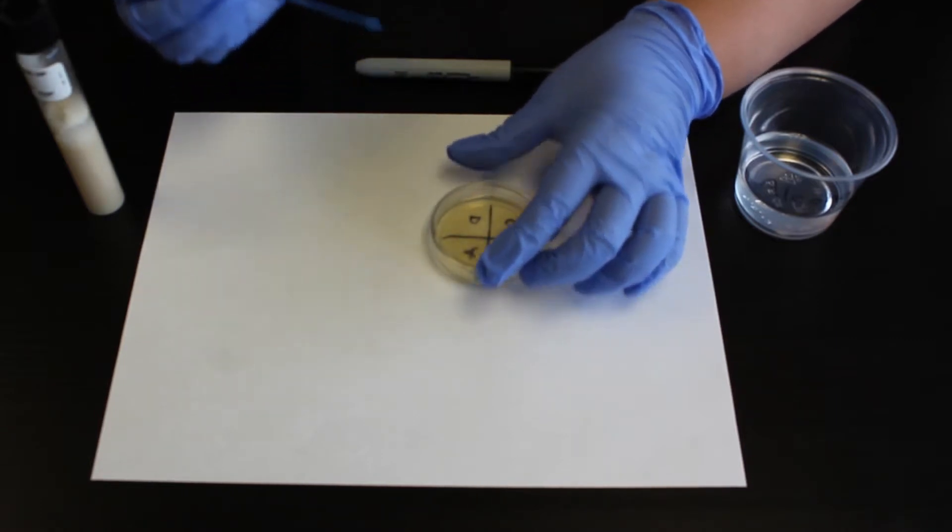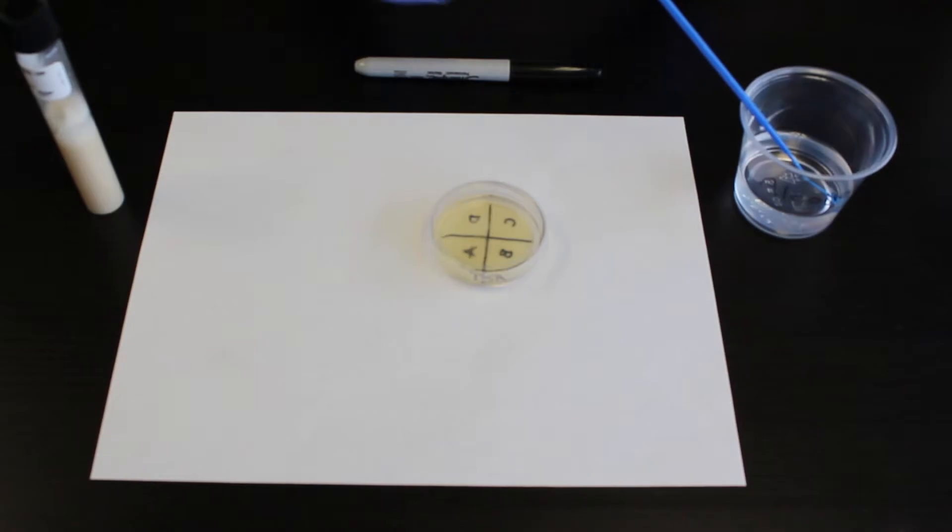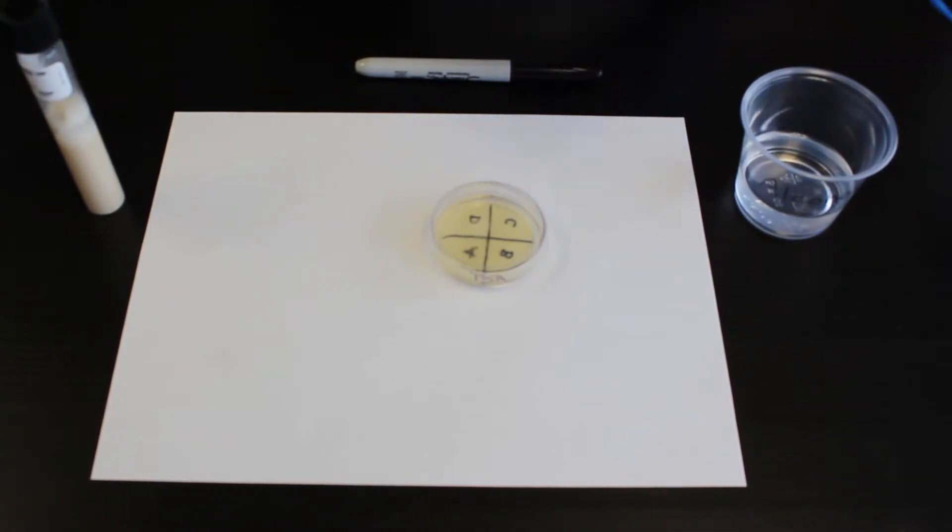Remove the loop, close the lid, return the loop to the beaker of alcohol for 30 seconds. Remove the loop from the alcohol and sling dry.